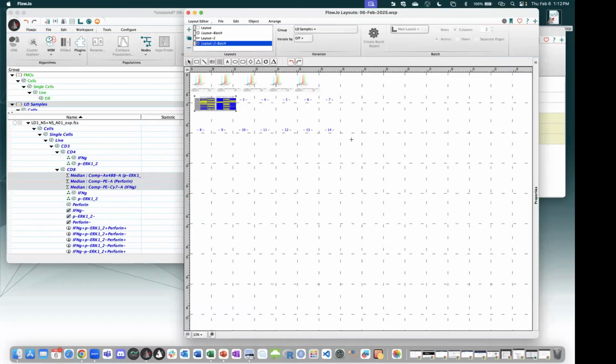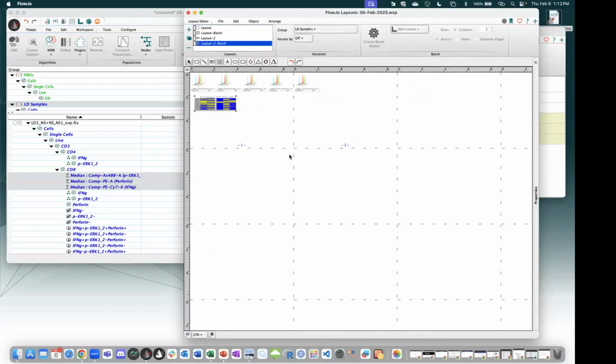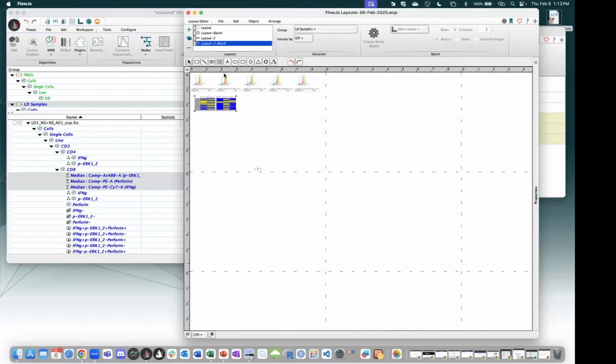In the layout editor, you can adjust it to, let's say, landscape. You have all those text, shapes, or whatever that you can use to create a nice report for this data set.